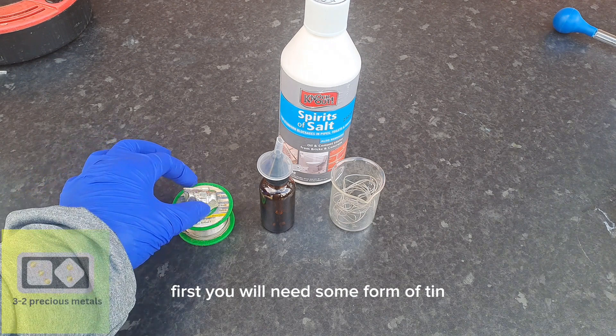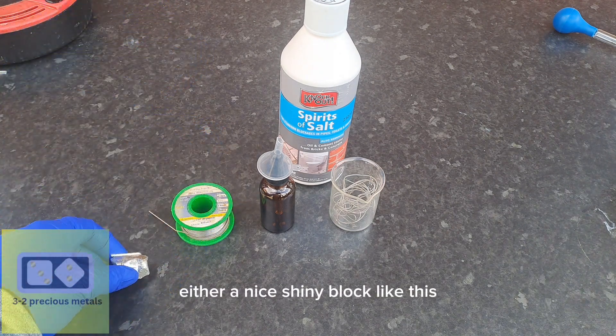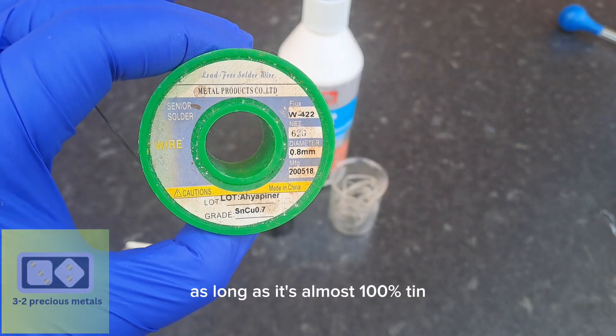First, you will need some form of tin — either a nice shiny block like this, or alternatively you can use a tin solder like this one, as long as it's almost 100% tin.